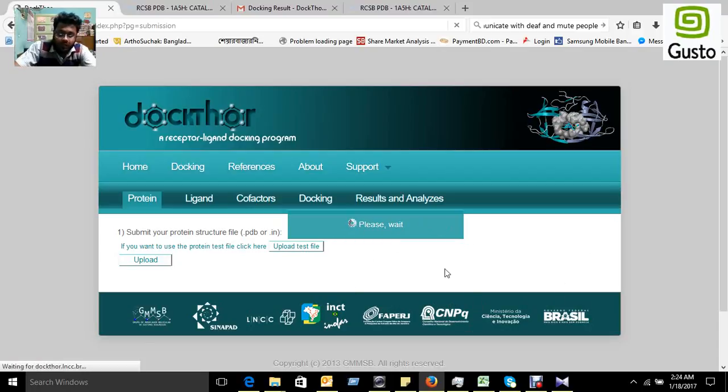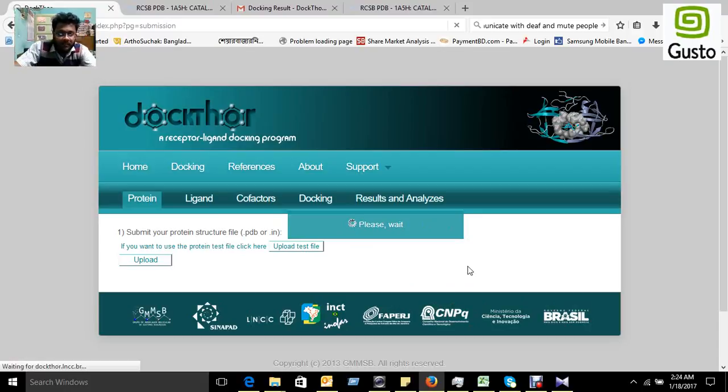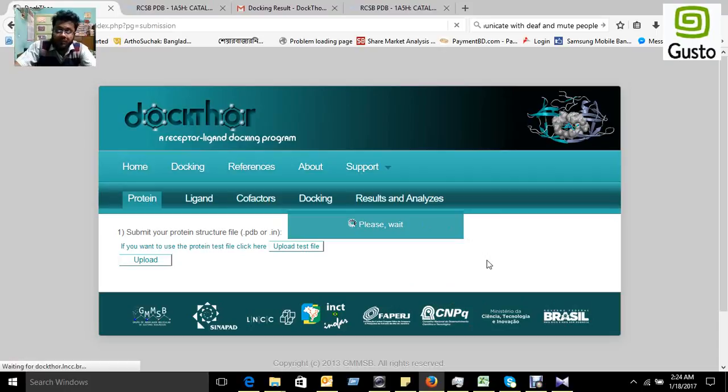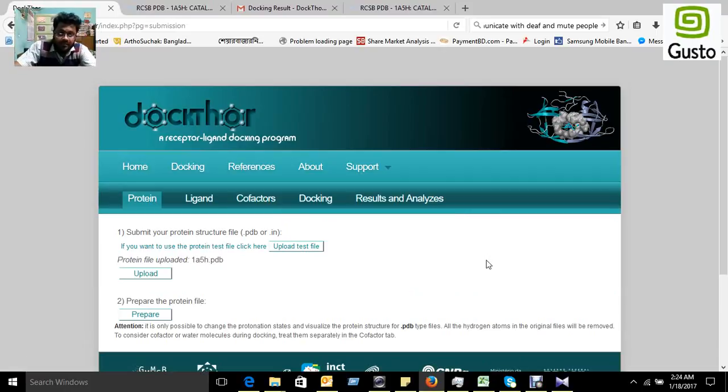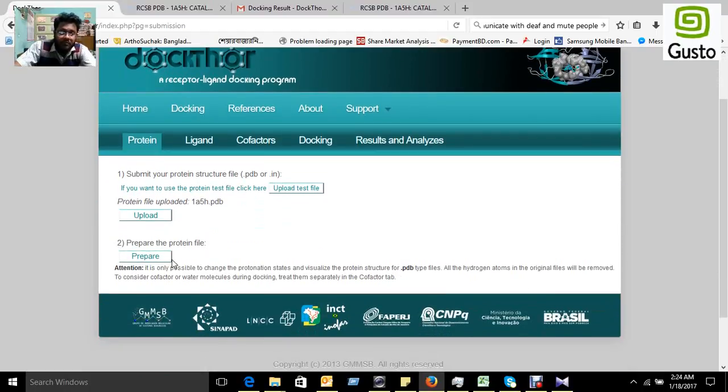It is working on for this protein. It will take some seconds and uploading is completed.